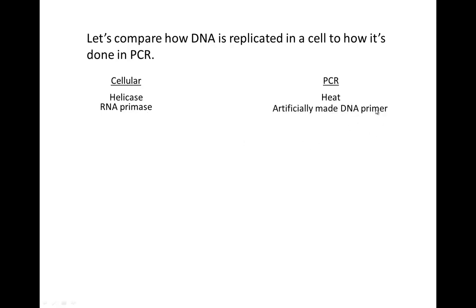Here, we're just going to use artificially made DNA primers. It gives us a couple advantages. First of all, we decide what the sequence of that primer is. And secondly, it's DNA, so we never have to go in and replace it. It just becomes part of the new molecule.